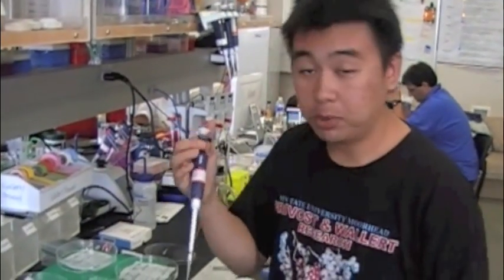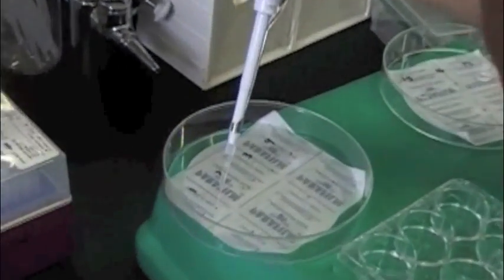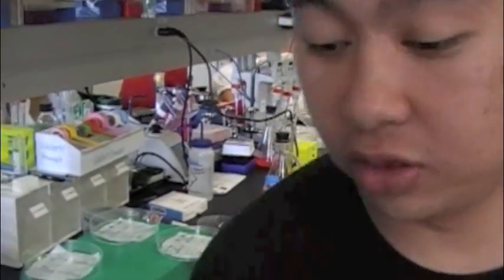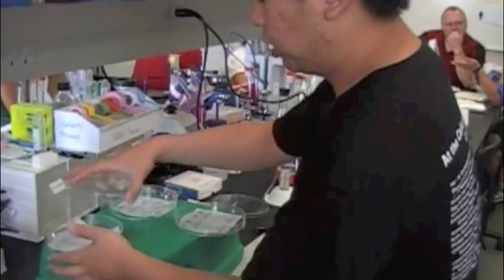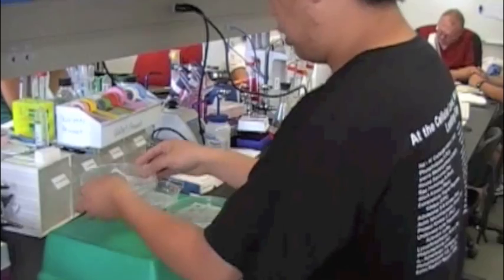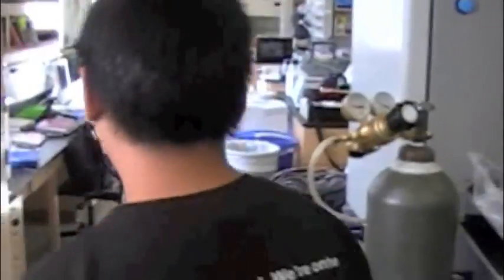After placing the cover slips in the incubation chamber, grab your P200 pipette set to about 100 µL and pipette warm blocking buffer right on top of each cover slip — you want a bubble of about 100 µL sitting on top. Do that for every single one. After transferring all the cover slips to the incubation chamber, you can discard the 6-well plates. Carefully cover the incubation chambers and place them in the incubator at 37 degrees for about 30 minutes.